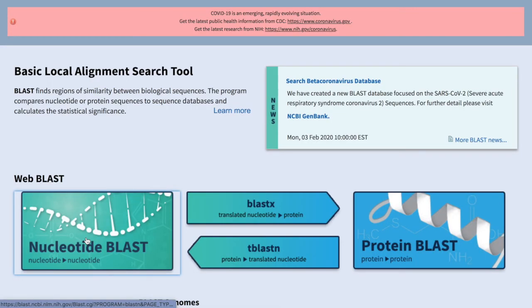You can also use BLAST in a similar way to compare protein sequences. Overall, it's an extremely valuable piece of software that allows you to compare an unknown sequence with a bank of known sequences.